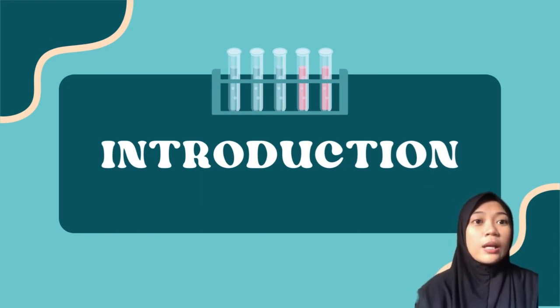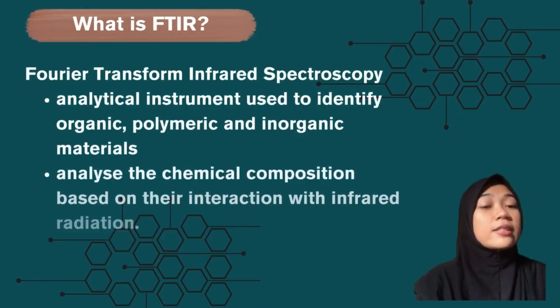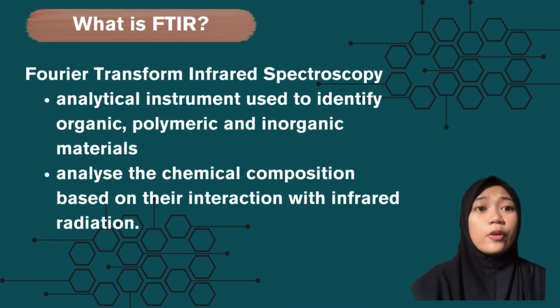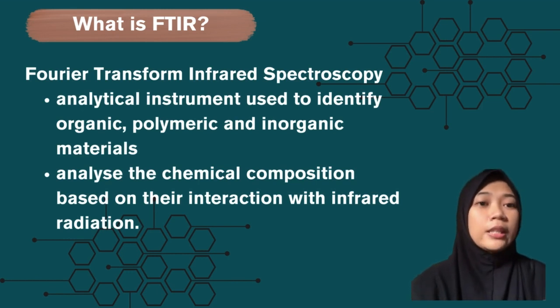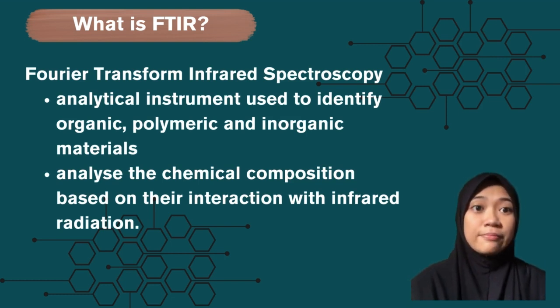So in this video, my group and I would like to present our assignment, which is analysis of milk powder using FTIR spectroscopy. So let's move on to the introduction. What is FTIR? FTIR stands for Fourier Transform Infrared Spectroscopy. It's an analytical instrument used to identify organic, polymeric, and inorganic materials. It is also used to analyze the chemical composition based on their interaction with infrared radiation.